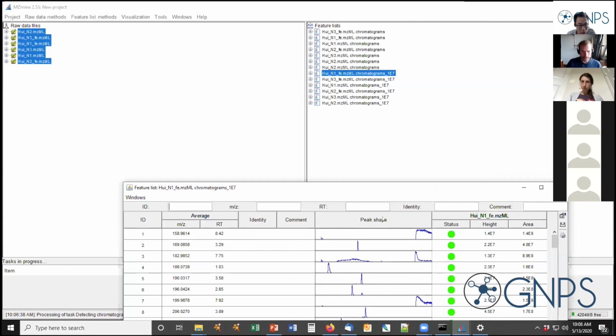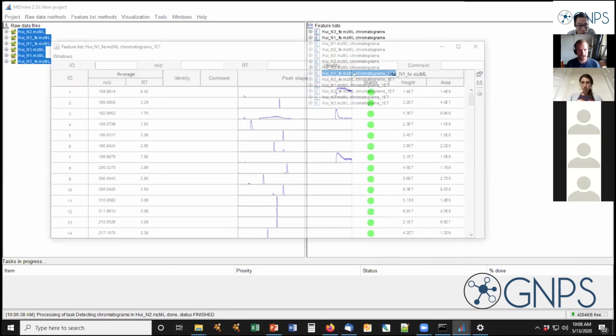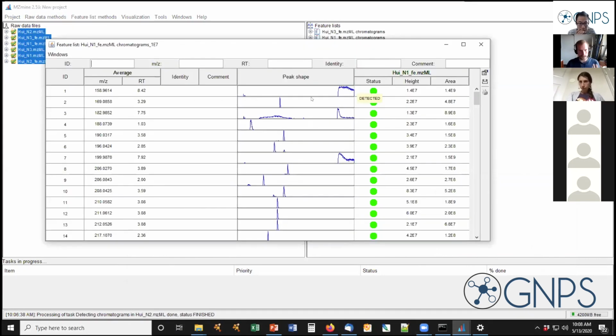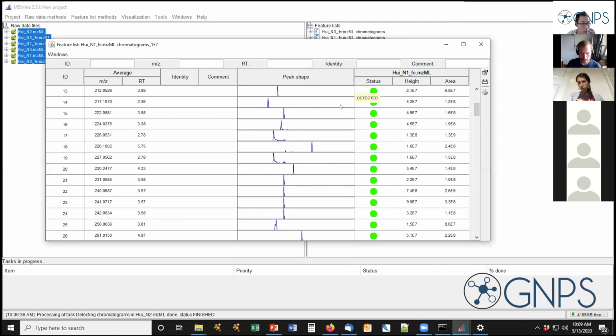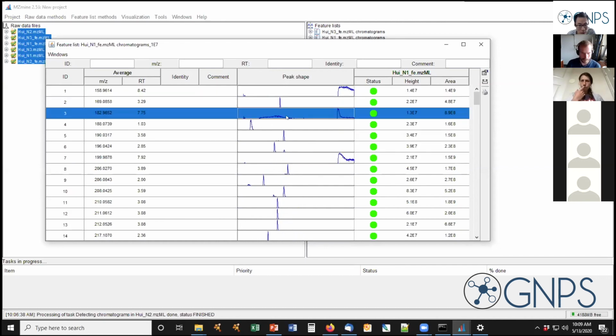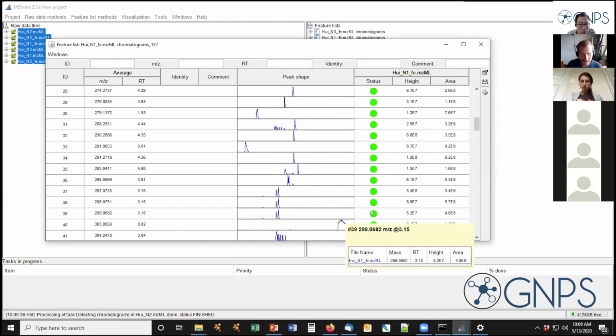Okay. Thanks, that's perfect. Going back to the peak list. How I got there was I simply double clicked on one of those, and you can basically see those peak shapes. Some of them at the end of the gradient look like noise or some type of contamination. Some peaks have a kind of hump, especially with dissolved organic matter. That's unfortunately a peak shape we observe quite regularly. And then let me find some nice examples.